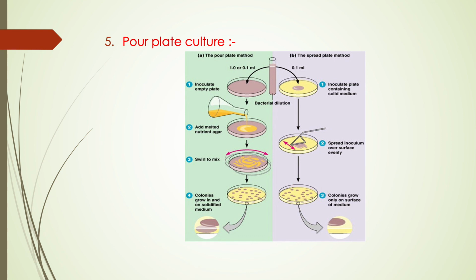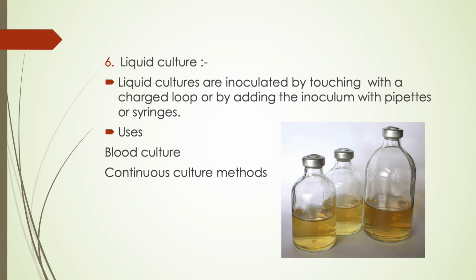And the last one is the liquid culture. Why do we need to use the liquid culture? We have tubes like this. If you have a blood culture, for example, if you have blood samples, how can you culture that sample? You need the liquid culture.